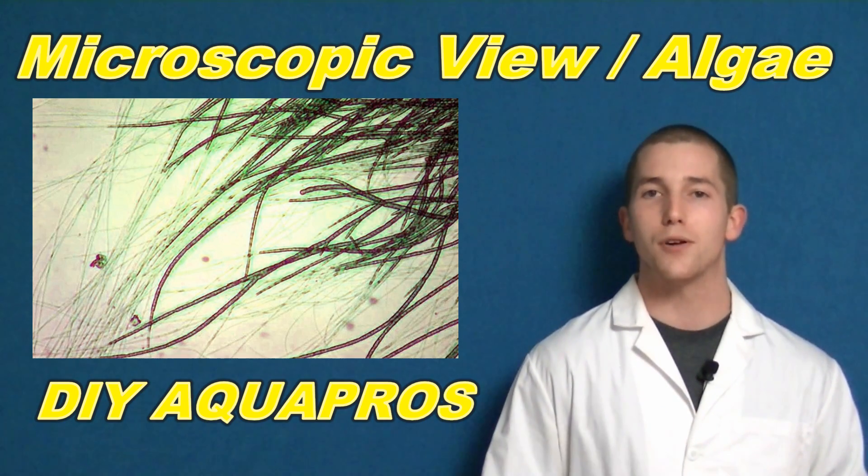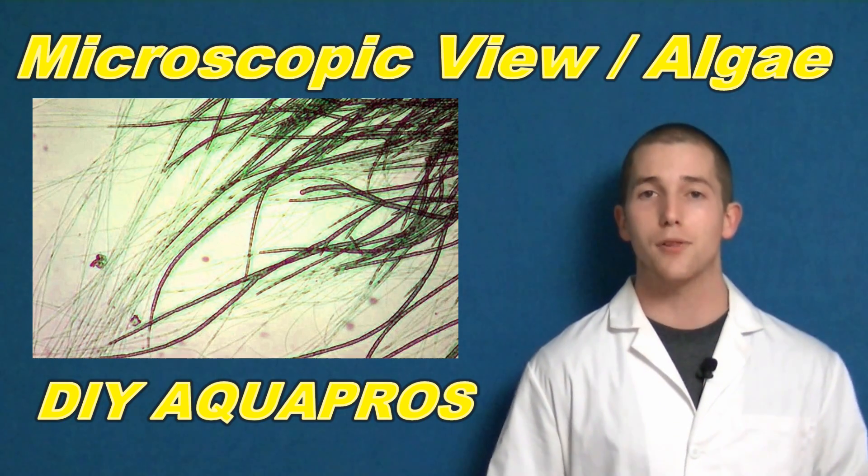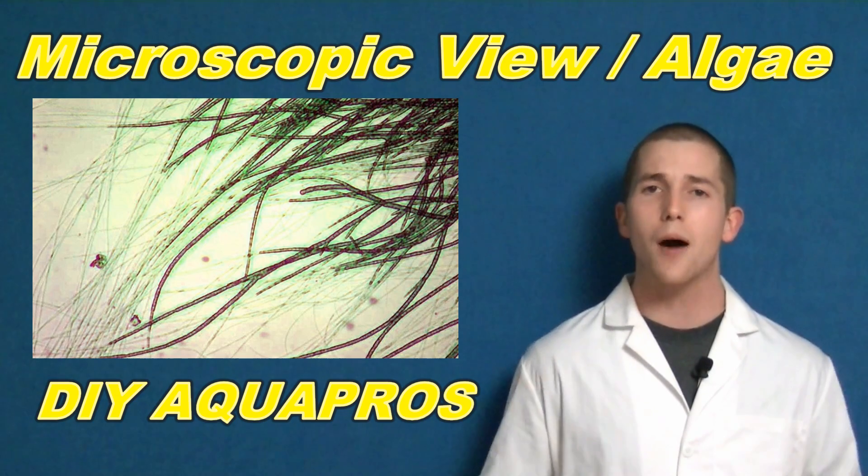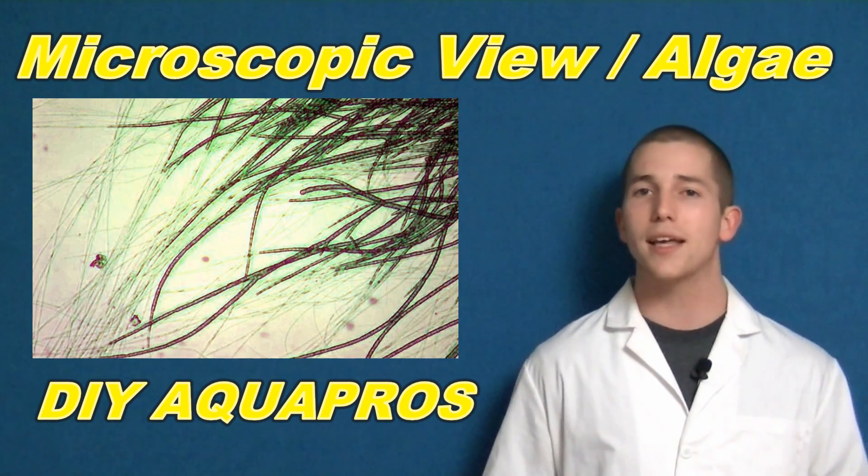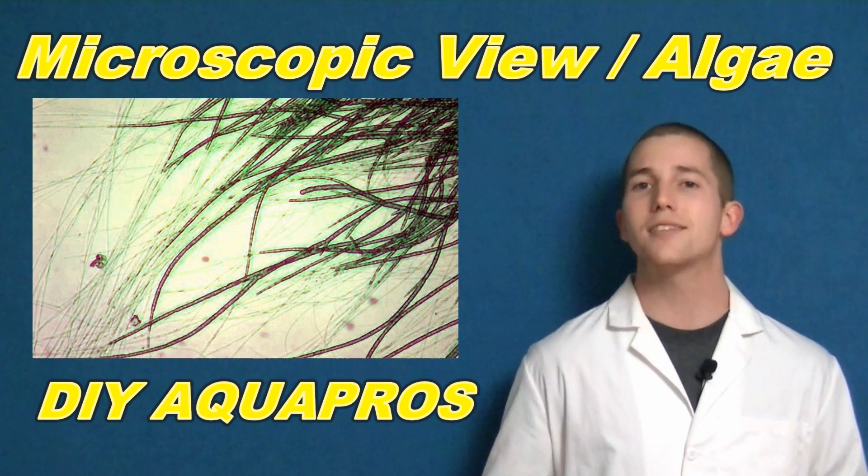Hey everybody, Mike here from DIY Aquapros. Today we're going to be taking a microscopic look at three different forms of algae commonly found in the aquarium. We're going to discuss their different morphologies and try and key out some important structures. Let's take a look.